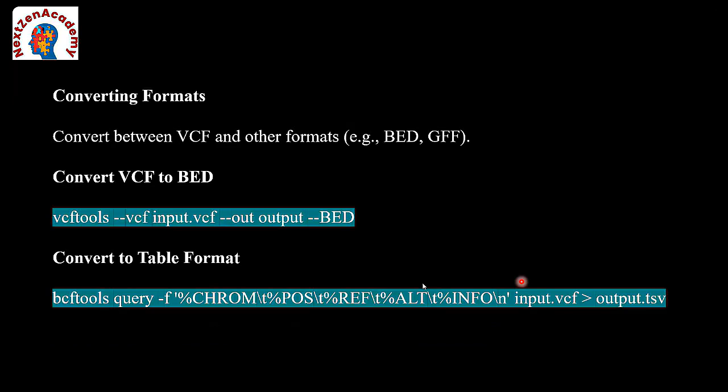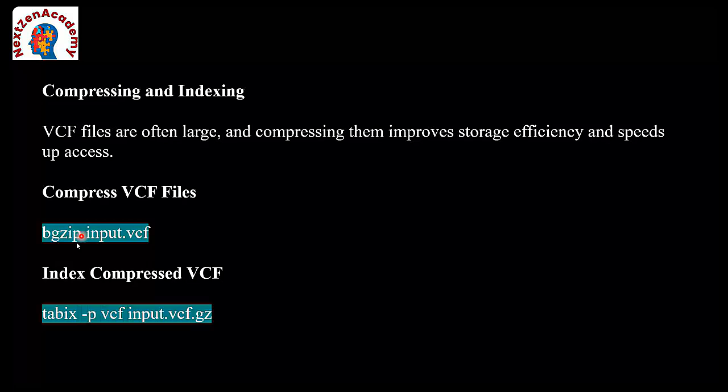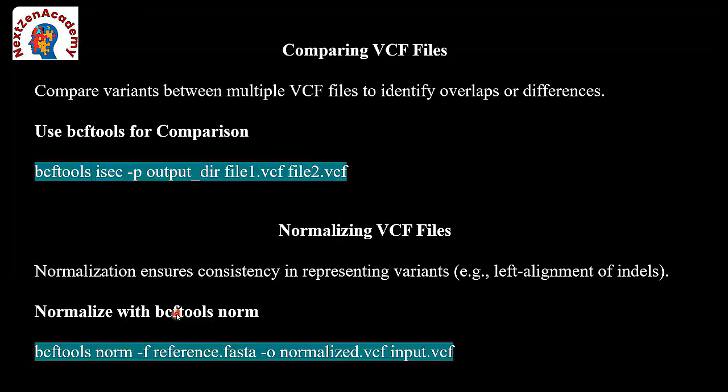Then you go into the data section. This is chromosome 1 at position 1234, 6. The reference genome G is getting changed into A. The quality is 50, which is good, and the filter is passed. The information about the change, the format, and the allele frequencies are all mentioned.